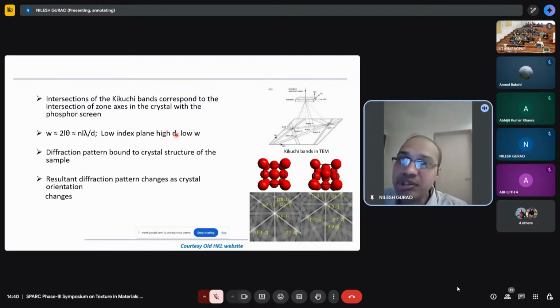So there you have to see what is the realistic pixel size that you are choosing, so that your grain boundaries do not appear stepped, but at the same time, you do not have too many pixels, unnecessary data. You are like overdoing it, right? So all this information you have to think even before you sit on the microscope.